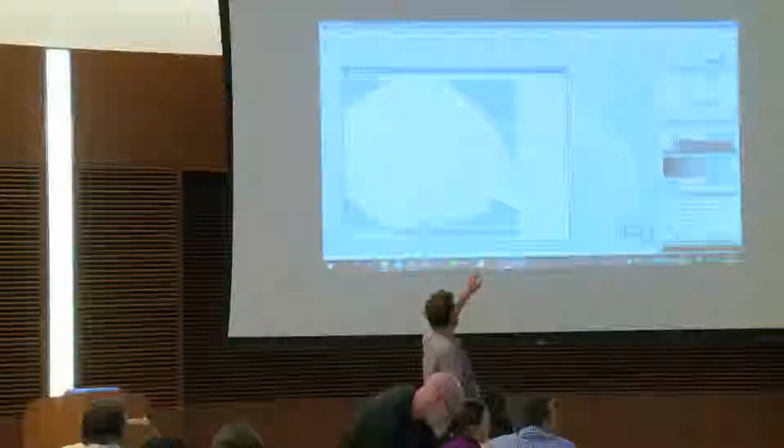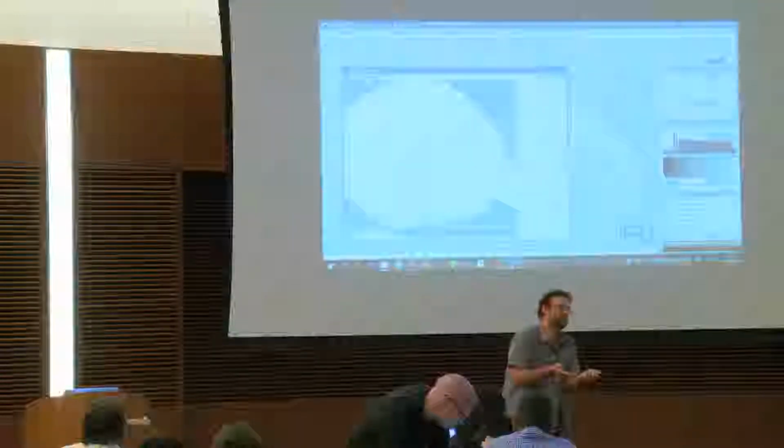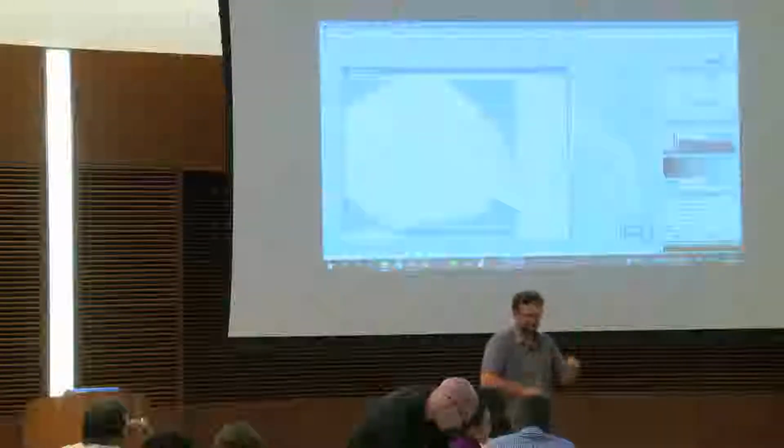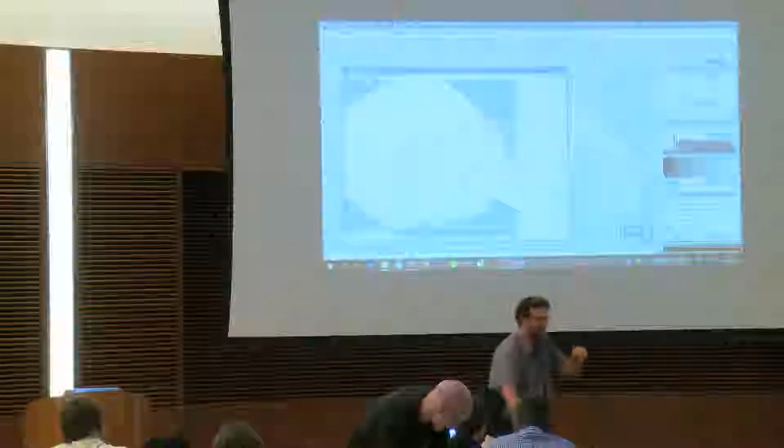Okay, so we have this horizontal line. So I have a secondary question for you. What does it mean? Oh, because I need to explain what atomic force microscopy is. No, but you will see, you can still answer us next time.